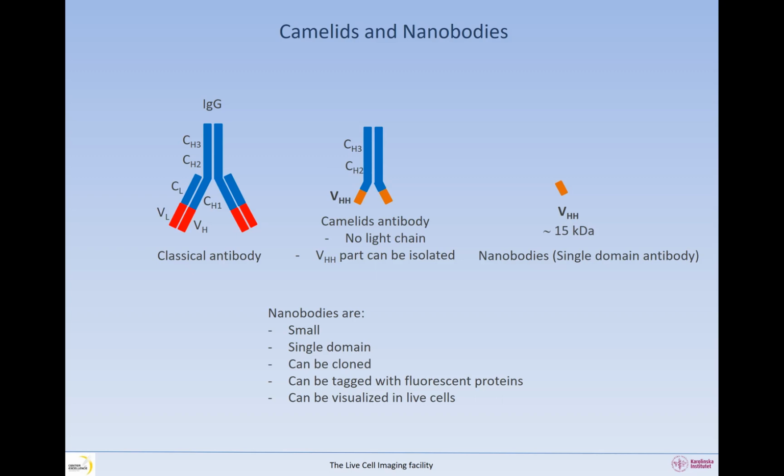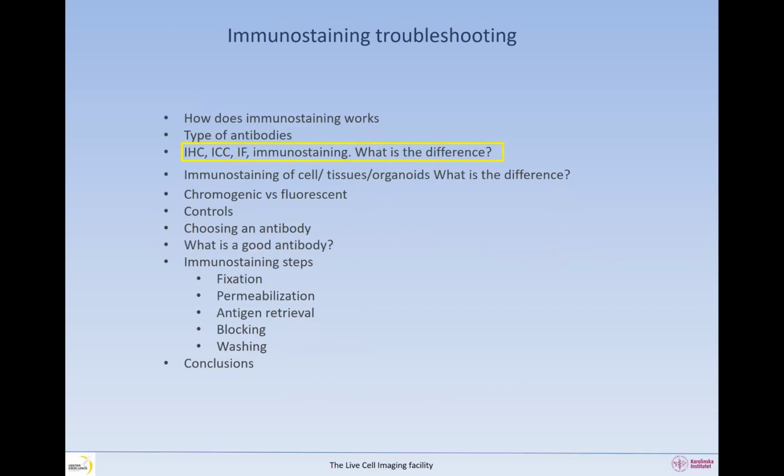So now that we know what antibodies we are working with and how they work, let's move on and talk about immunostaining and the different types. Is there a difference or not? Let's see.